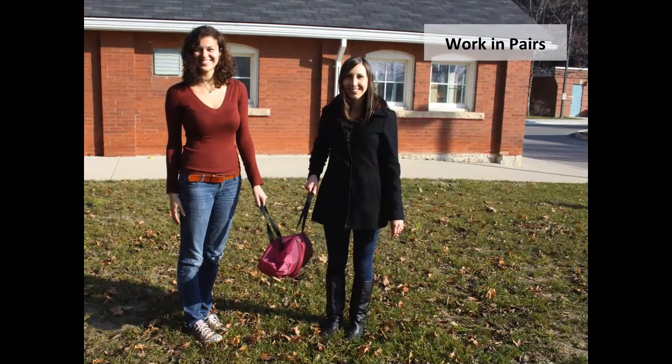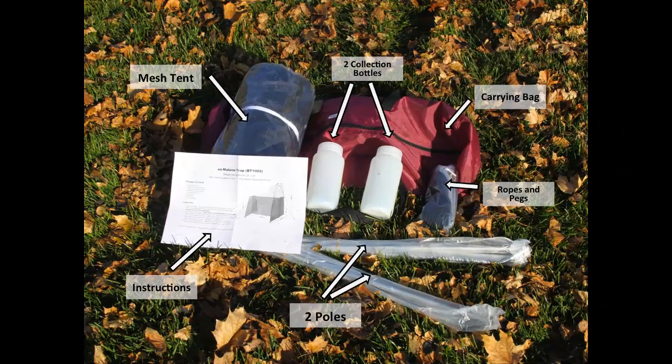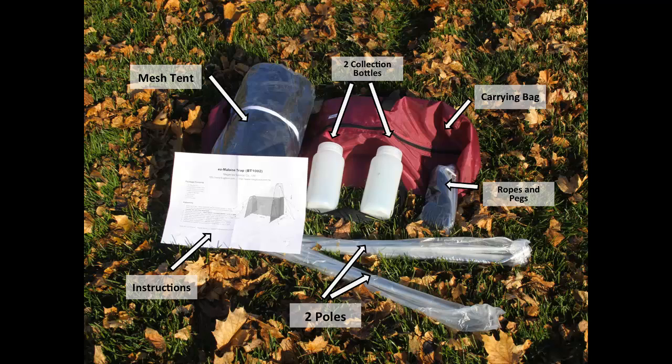It is easiest to work in a pair when setting up a malaise trap. A malaise trap comes in a carrying bag with the following typical items: a set of instructions, two poles — a short pole and a long pole.